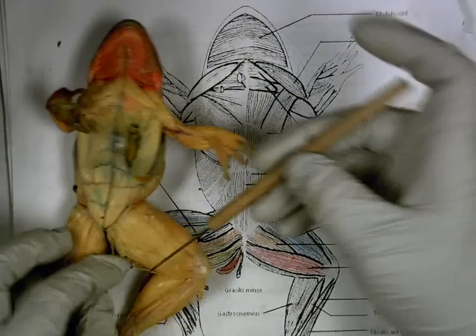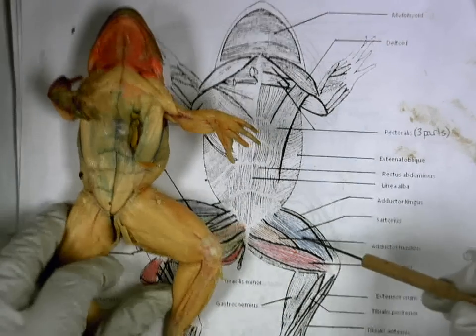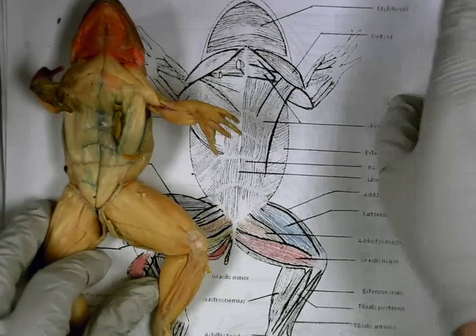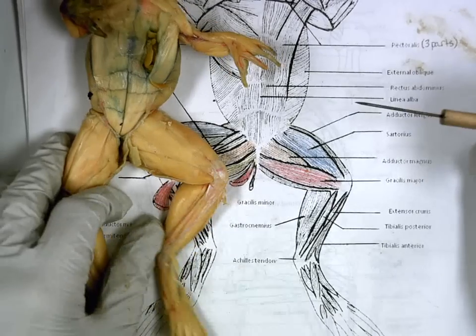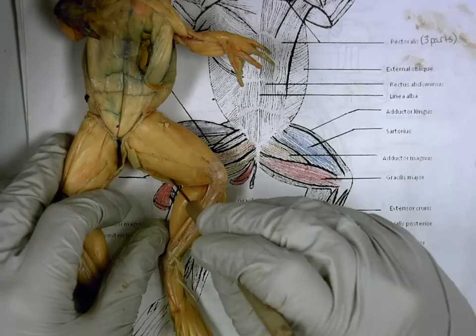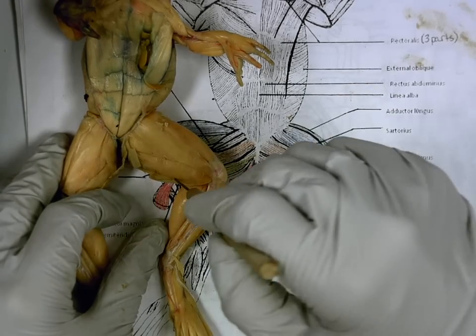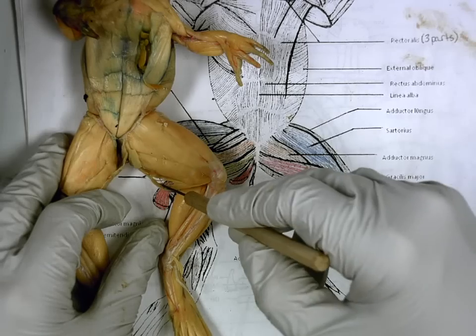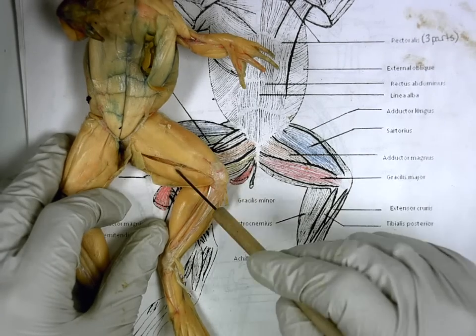Now if we go down further, you should have this thigh that looks just like this beautiful thigh diagram here. And you should have this, we'll work five going up. Bottom one? Gracilis minor. Big one above it. Gracilis major.